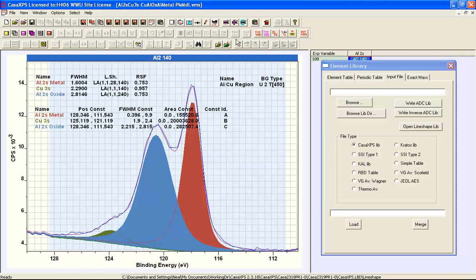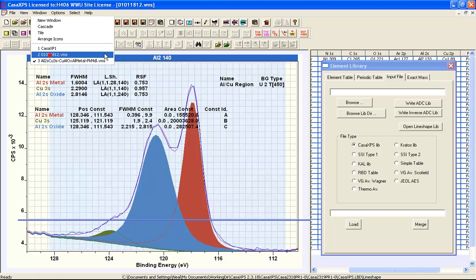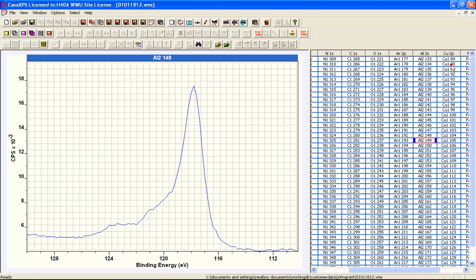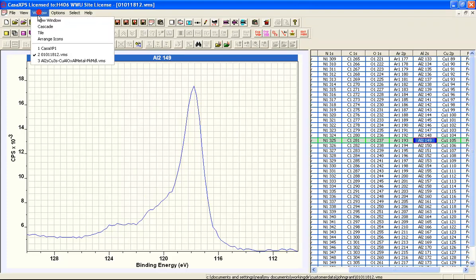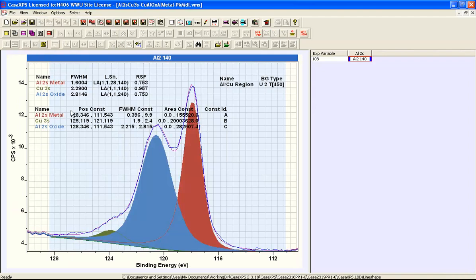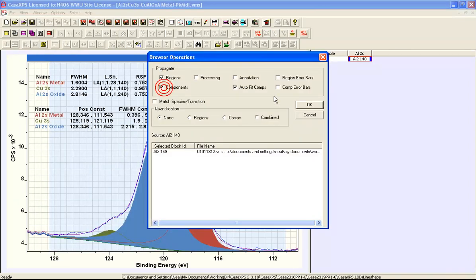I can now return to the file containing the depth profile, select one of the aluminium-copper intervals corresponding to the saved peak fit, and then propagate the regions, components, and fit. I won't propagate the annotation because that is information within the VAMAS file to help me remember the conditions and constraints for this peak model. So I'm just going to do regions, components, and then fit.